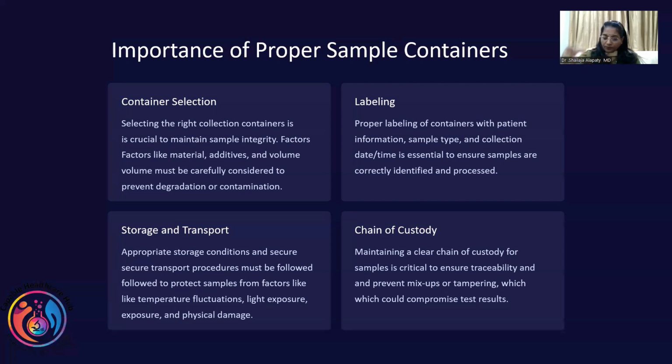We have to maintain the chain of custody. From one place to another place, when we give it, we have to ensure that we are able to trace. Where did it start? Who came and gave it? When did they receive it in the lab? When was the sample processed? When was the result given? The sample was collected at 7 o'clock in the morning. It came in the evening at 4 o'clock. We ran it at 10 o'clock, reported at 12 o'clock. Only when we document will we come to know, oh my God, it happened like that. And then when we come to know, we have to ensure we put a system into place for the chain of custody.